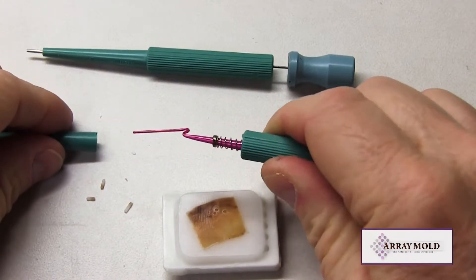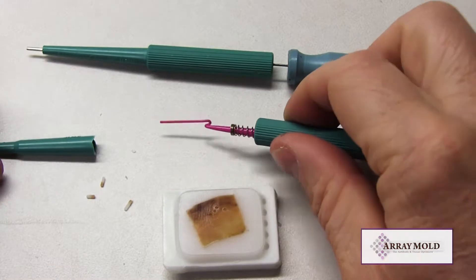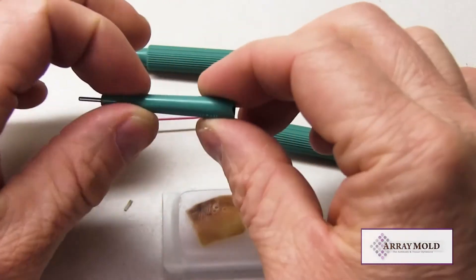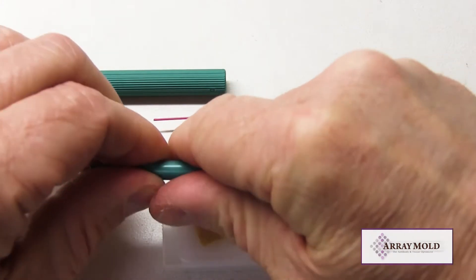The array mold has been around for 10 years and is the first and original silicone mold TMA instrument. We tested the plunger needle early and found that it was inadequate for TMA construction, and that is why we went with the needle and stylet design instead of the plunger needle.